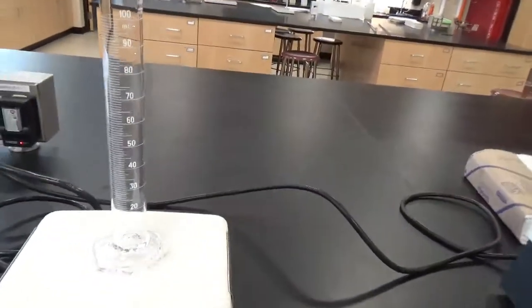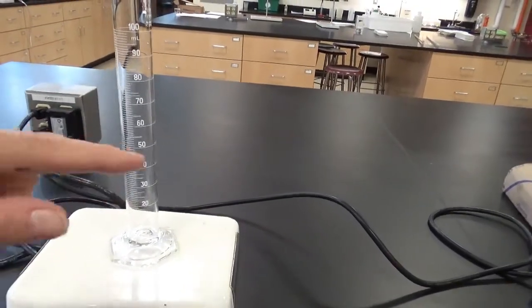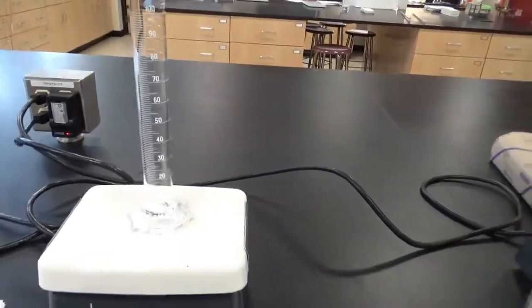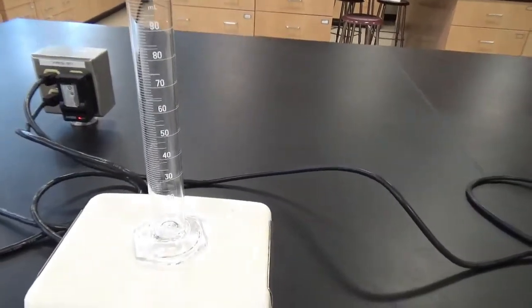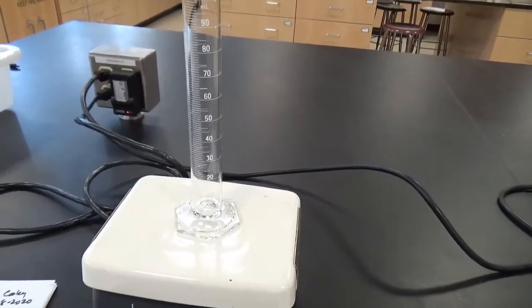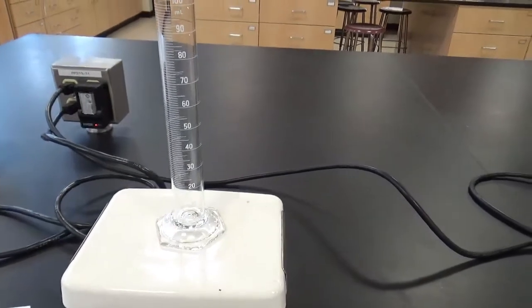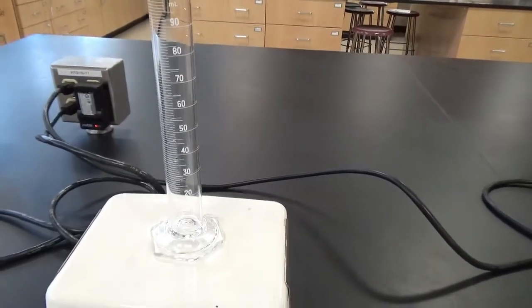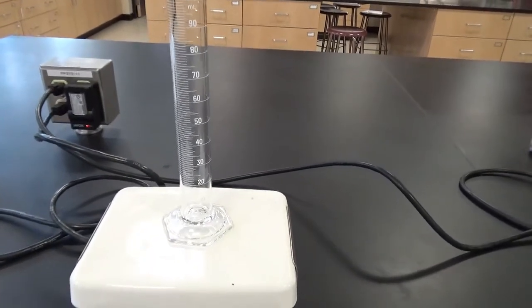Then we're going to record where that dividing line is between the 2 layers and where the top volume is. And then we're going to input those volumes into an Excel spreadsheet that allows calculation of the concentration of water in the upper layer and the concentration of butanol in the upper layer, and also those concentrations in the lower layer.